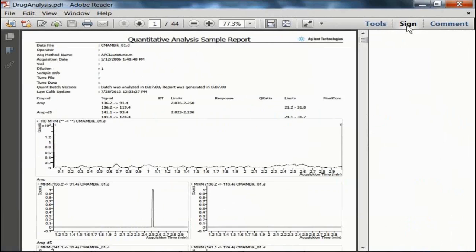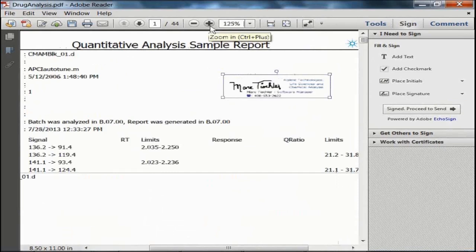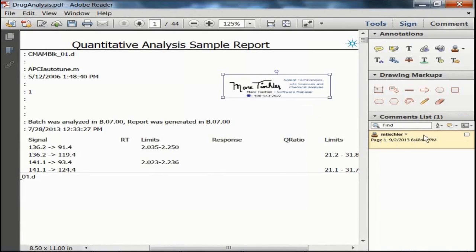This goes a little bit further and shows you some of the tools that come with Adobe, where, let's say, the QA person could put their signature in there, and it is recorded in Adobe's actions, and the document does understand that it was approved. So that could be useful in keeping track of who looked at it and sent it through your pipeline.